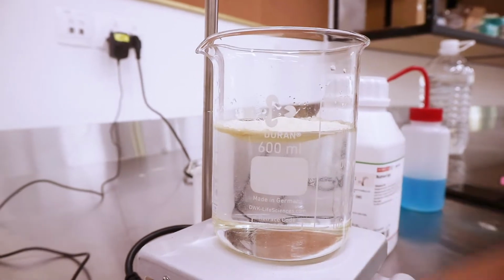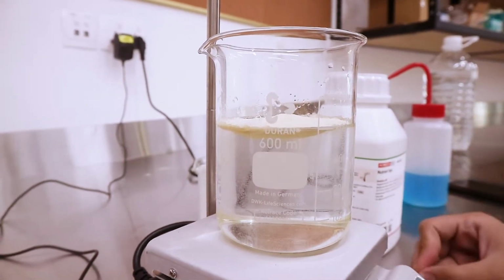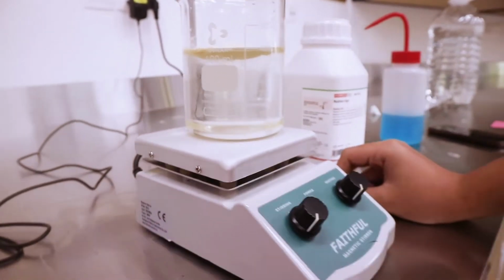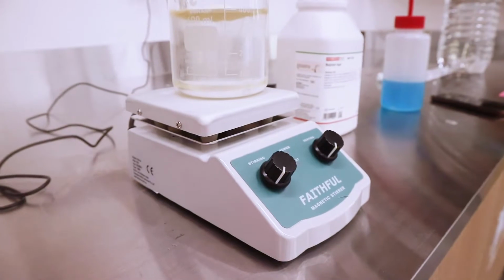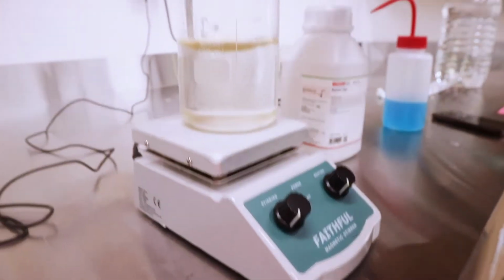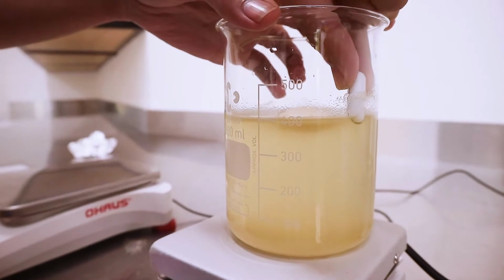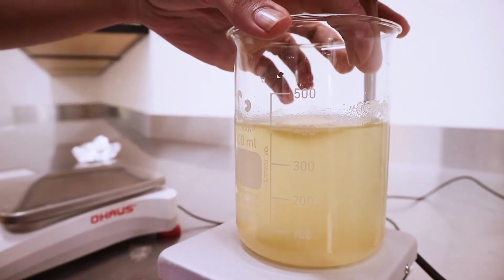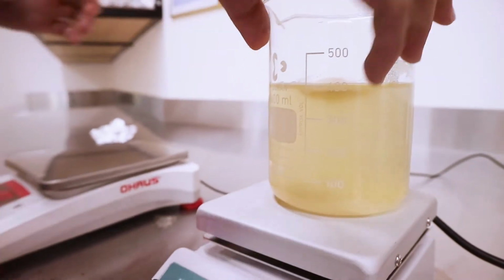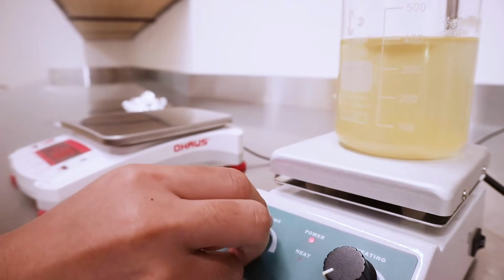Yeah, and the next thing you want to do is stirring it. We may use a glass rod. I actually prefer using this. Put this magnet in very gently, and then stir it.